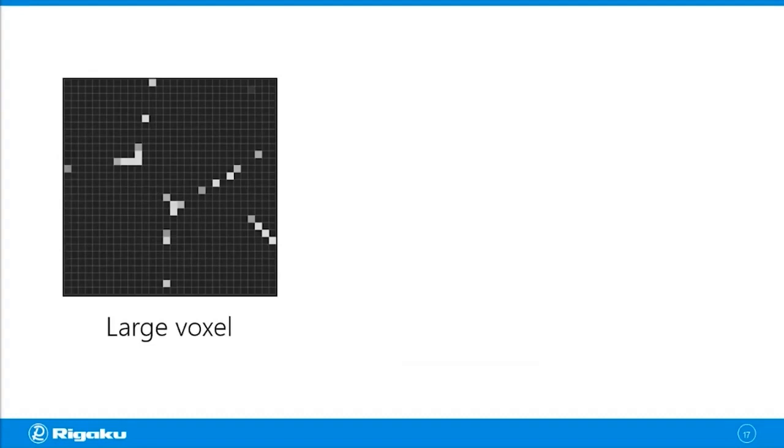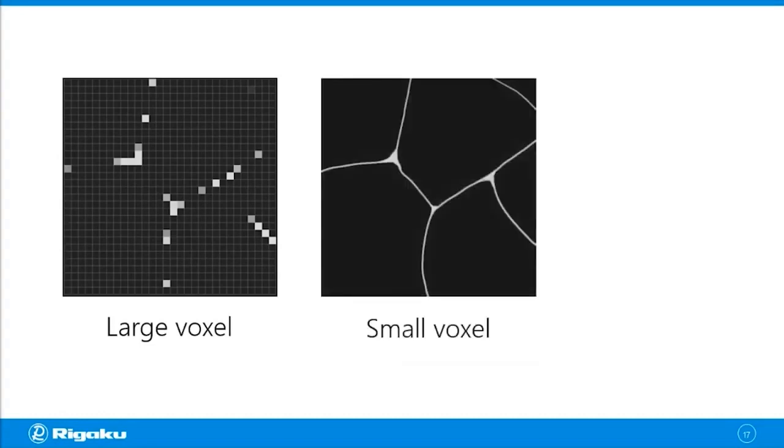And if you use too large of a voxel size, your image might look like this. You can't even see what kind of structure you have there. But if you use a small enough voxel size, you can get an image of what the structure looks like. And in this example, let's say we're going to look at a relatively small or narrow part of this structure, and it's 2 microns in size.